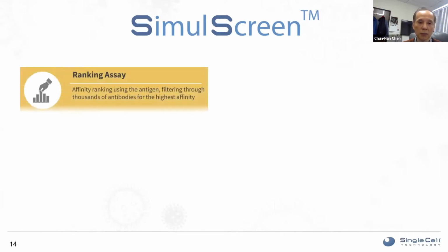And then let me introduce you to some of the modes of screening in the antibody capture portion. We call it simul screen because we do these antibody screens simultaneously here. So first of all is a ranking assay by normalizing the amount of the signal. If you have that on each one of the spots of the antibody capture, as well as flowing the antigen or the screening molecule at different concentrations, you can have a rough ranking of the affinity of the antibodies that are captured on the slide.